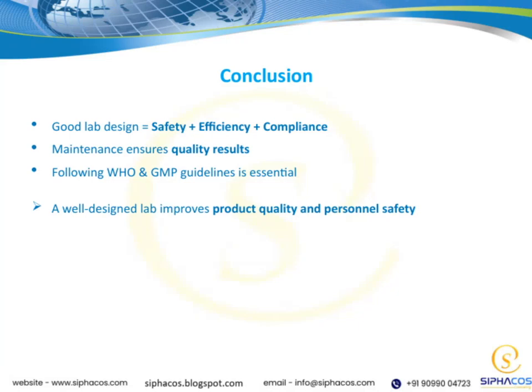Let's wrap up with some key takeaways. A good lab design is really the foundation of success, combining safety, efficiency, and compliance. When the lab is well designed, it not only protects personnel but also streamlines workflows, making everything more efficient. Consistent maintenance is crucial because it ensures that we get reliable, high-quality results every time.